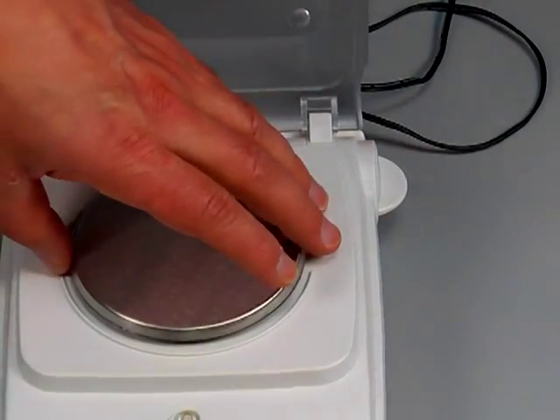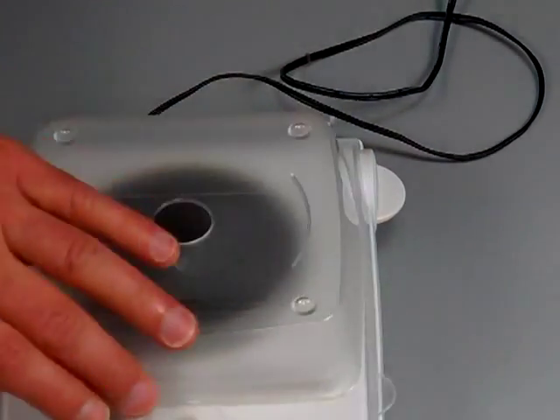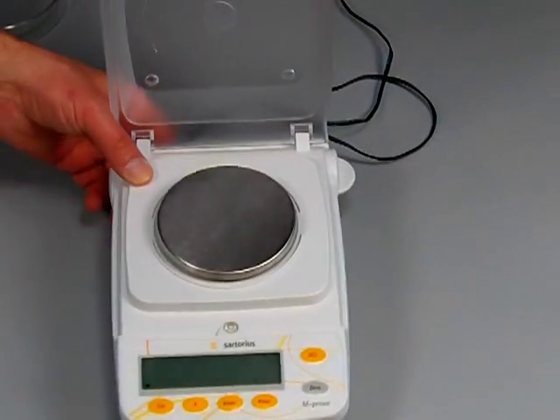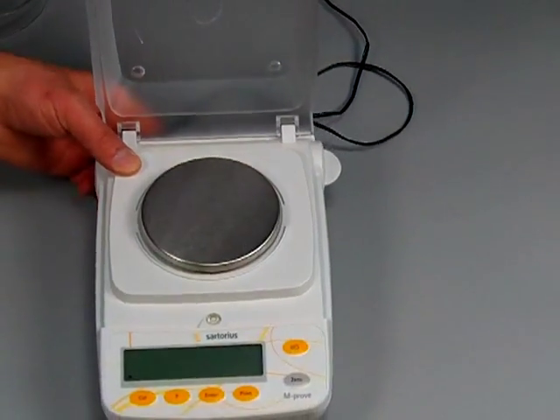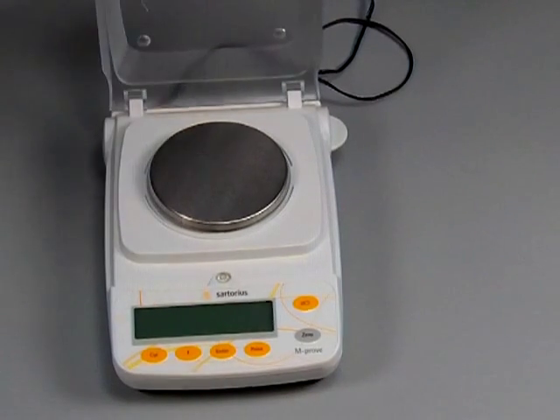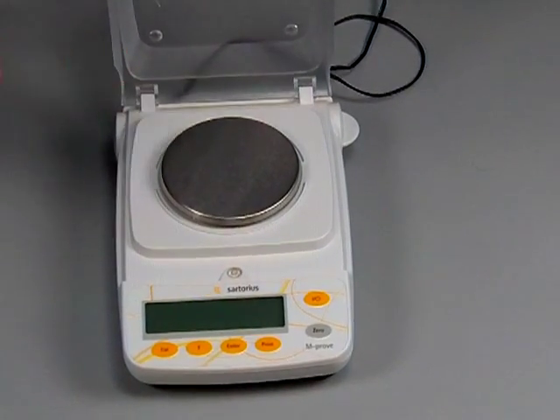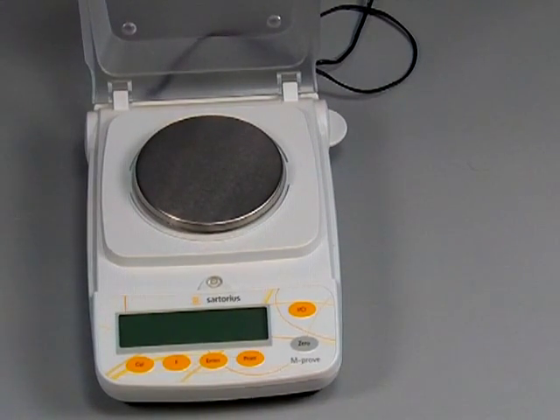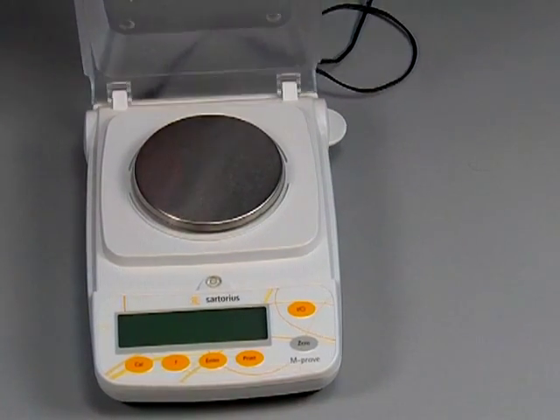Some other features I want to show you about this balance: it does have a spirit bubble indicator for leveling the balance, although it's kind of small. This is what they've installed. I'd rather have a nice big bubble, makes it a lot easier for leveling the balance, but that's the way they developed this product.